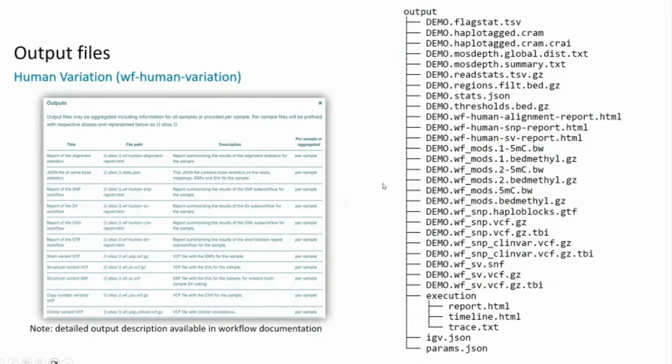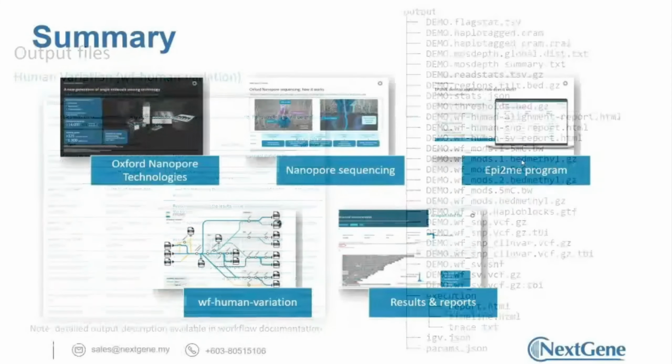Yeah, so the output file looks like this. Depending on the file names, I think we can already guess what data is captured within. But to double confirm, you can also check out the documentation for more details on each of the output files.